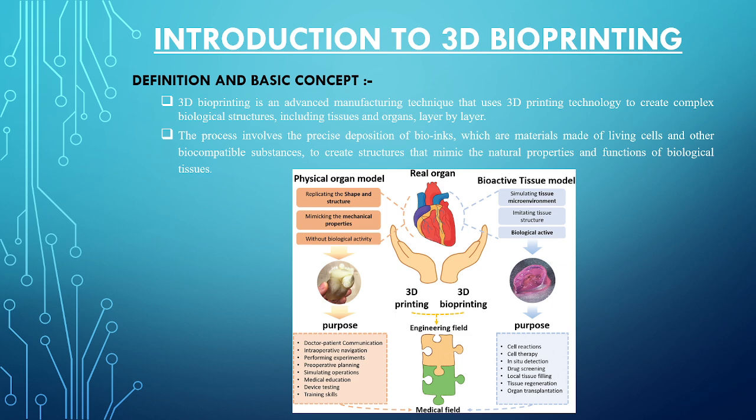So the technology I'm going to talk about now is 3D bioprinting, where we are going to print organs, right? So the things we have so far in our hands, the 3D printed materials, especially a souvenir, a cup, some kind of a box or something like that. Similarly, we are going to have our own organs, human organs, in our hands by using this technology, right? So that's how I'm going to give you the idea about this technology, right?